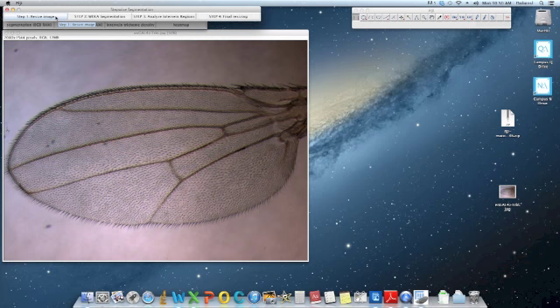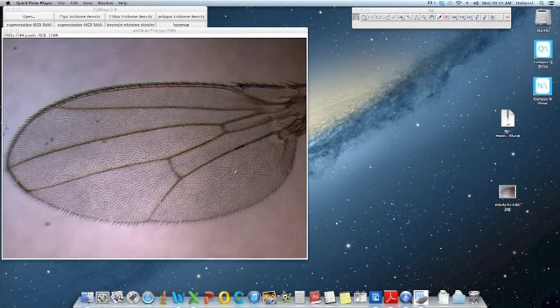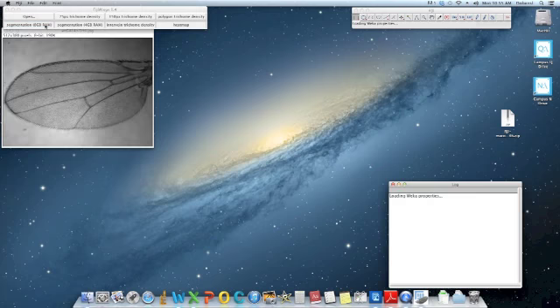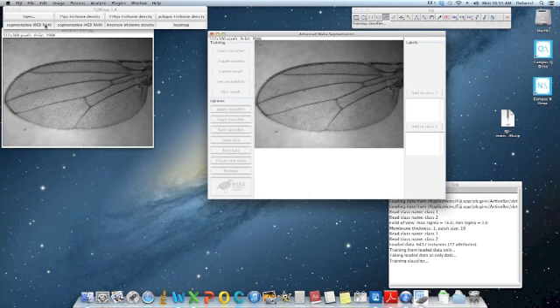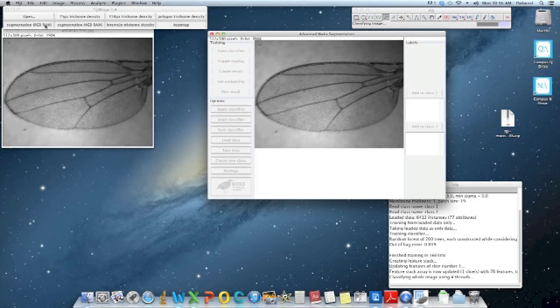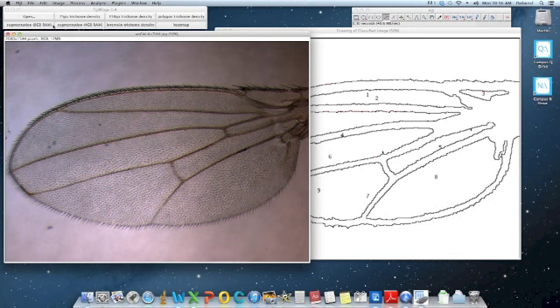So you can resize the image by clicking on this, and then launch segmentation analysis, analyze the intervein regions, and finally resize the image. 8 GB segmentation analysis is launched by clicking here, which resizes the original image and launches Weka segmentation analysis. This tool identifies and outlines the veins and intervein regions, and then automatically performs particle analysis, sending the data to an ROI folder, which is presented as a drawing. This resizes this drawing, placing it next to the original.